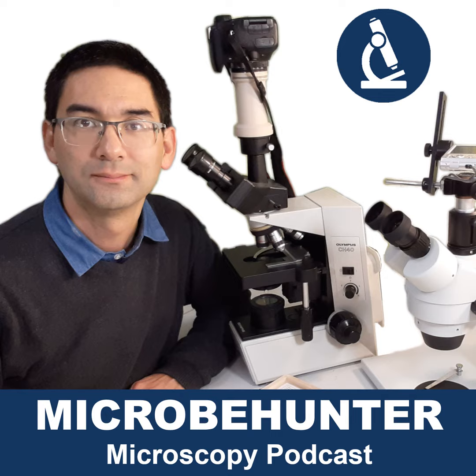Maybe I know that Leica, this company, also has educational microscopes in the series, which are still based on the older 160mm standard. But generally they all moved over to infinity optics. And this means that you cannot exchange your objectives between these microscopes anymore. I think one of the reasons is not only the technical advantage of being able to insert filters, but I think this was also a way for the different companies to, how shall I put this, push their own system a little bit.